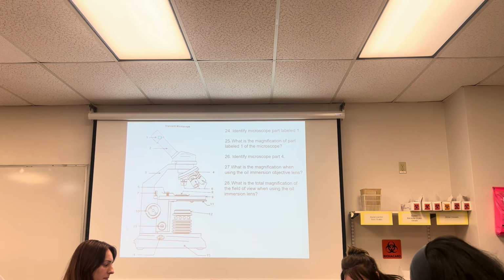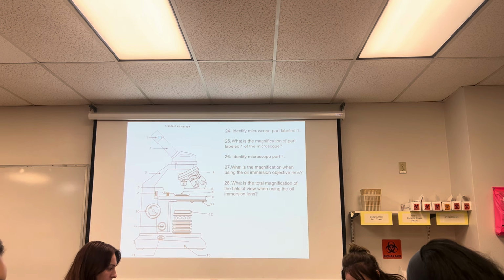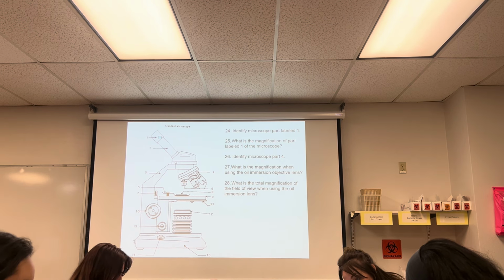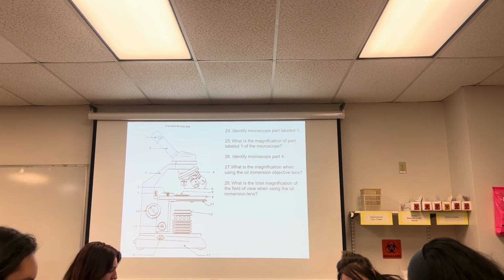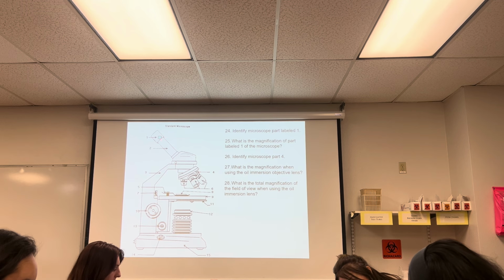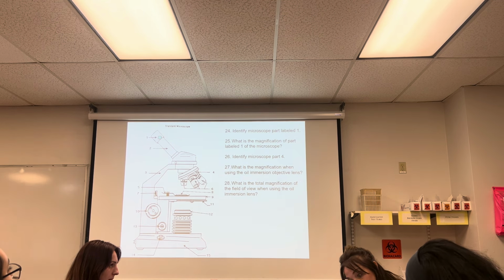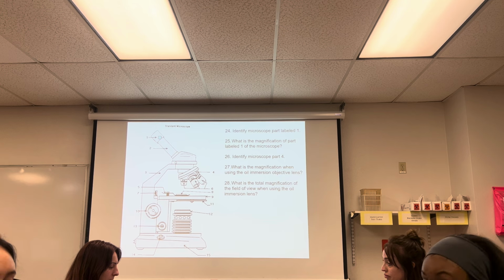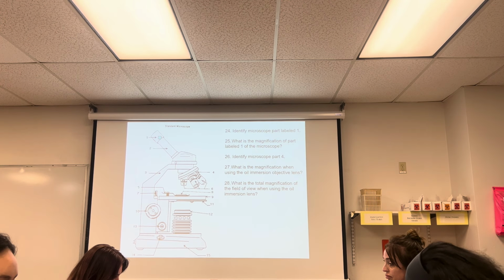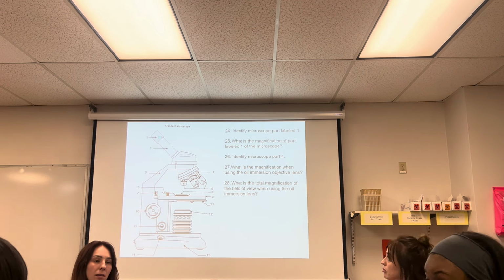Okay, so I will have pictures of a microscope. This is just a rendering. But I don't like to ask questions about all the parts of the scope. I only like to ask about the most important part. And the most important part is these two knobs right there, and this little bitty lever right here. The stage? No, not the stage, the diaphragm. Oh. Okay. So 9 or 11?